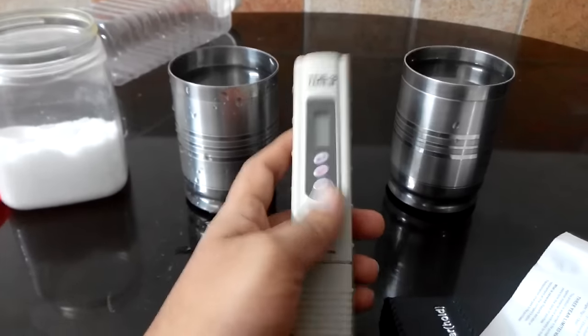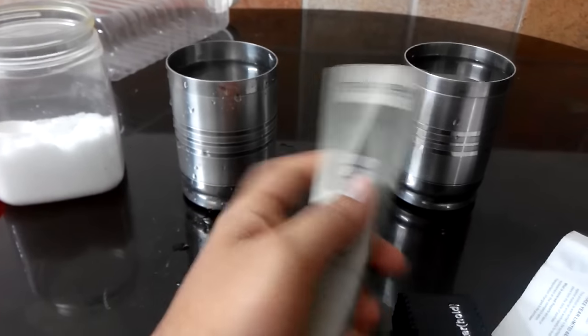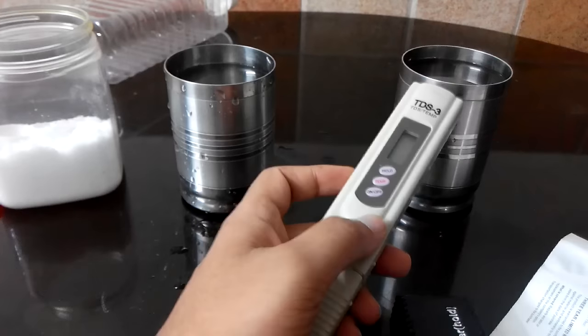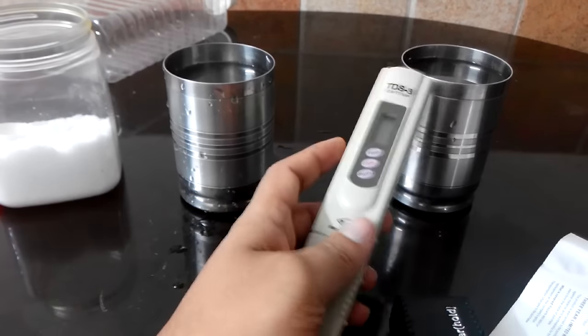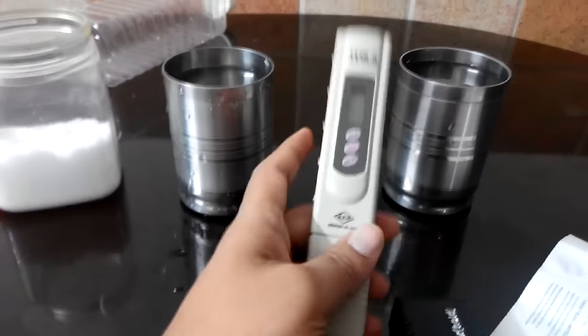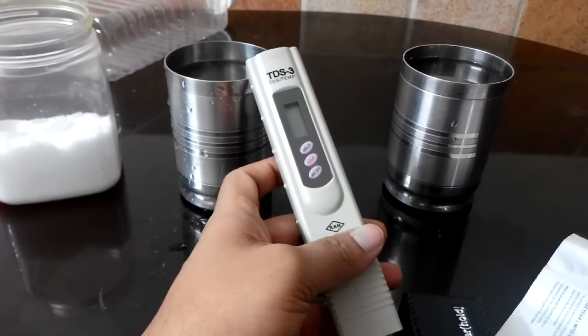I have two tumblers here. This left one has tap water and this one has packaged drinking water, Bisleri water. Ideally, this Bisleri water should have less TDS than the tap water.